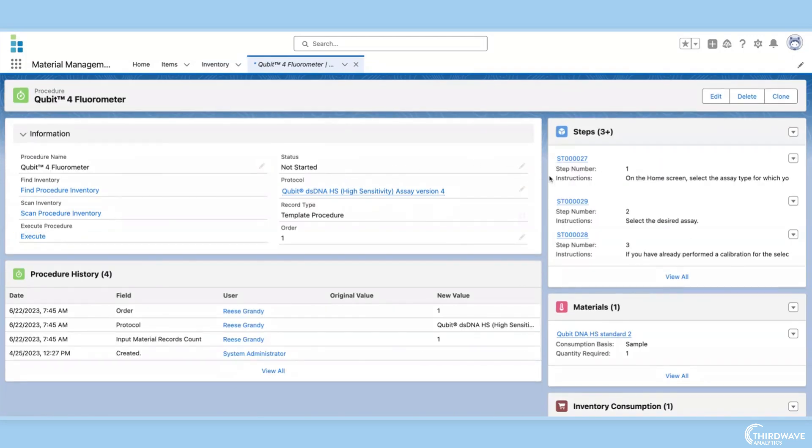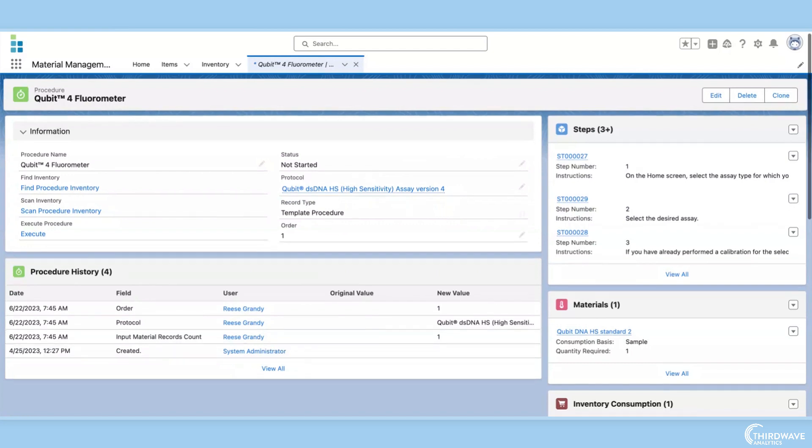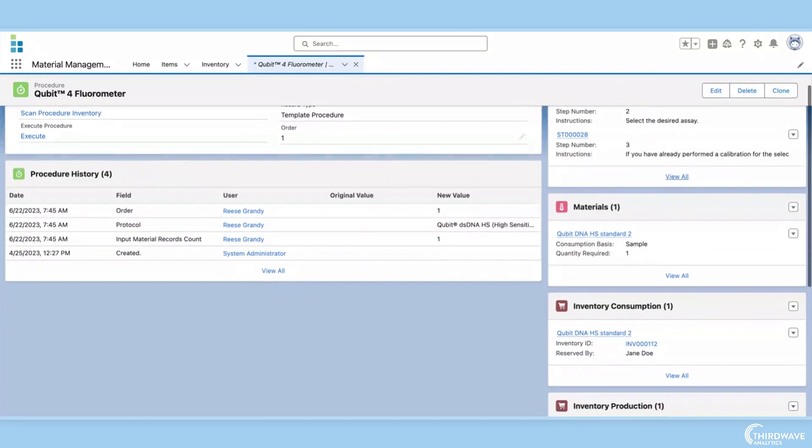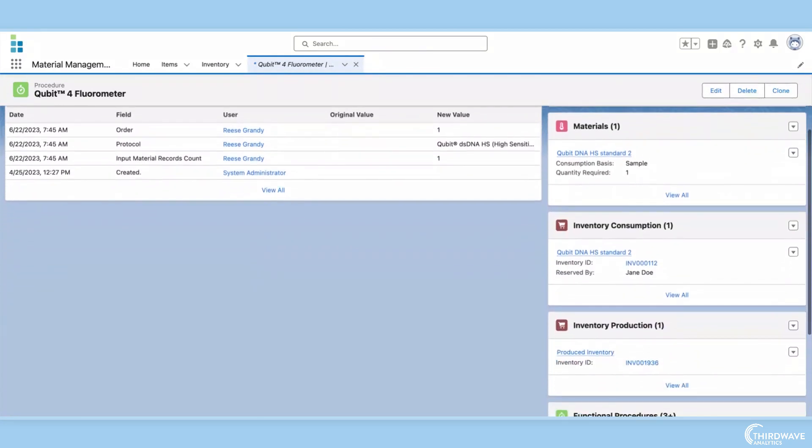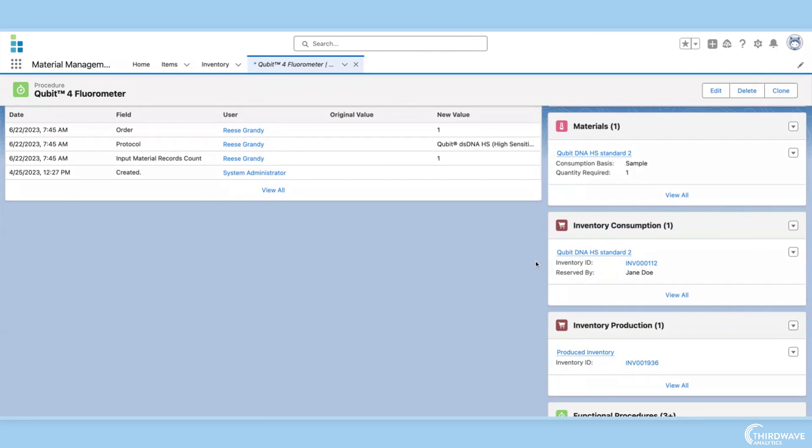Protocol execution is one of the most important applications of Lockbox's inventory management module. Lockbox allows users to reserve inventory for protocols and will automatically decrement inventory from the LIMS inventory records when the protocol is complete. Furthermore, if the protocol produces new inventory, Lockbox can also automate the creation of new inventory records.